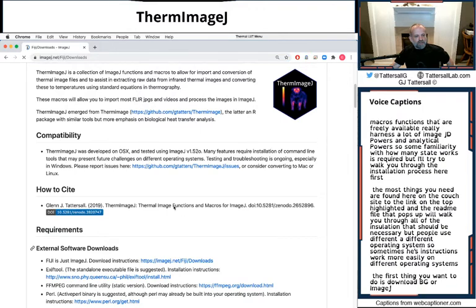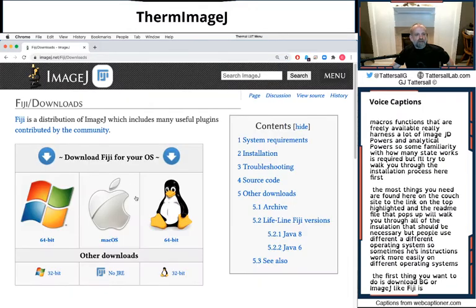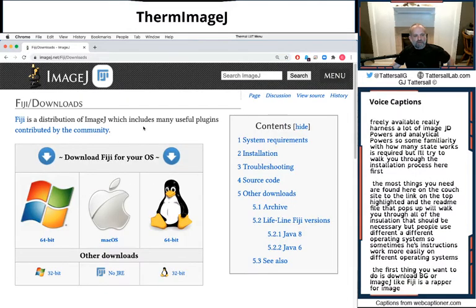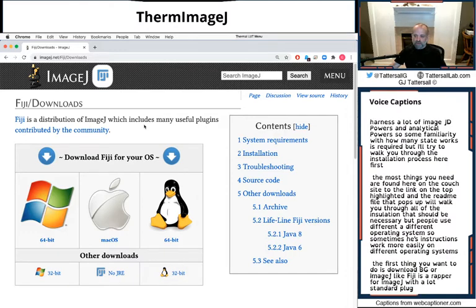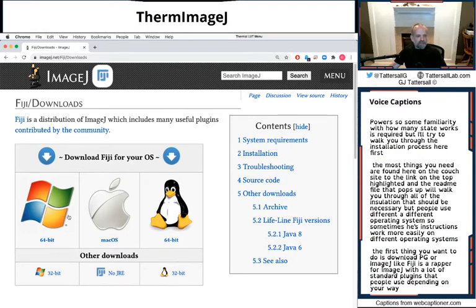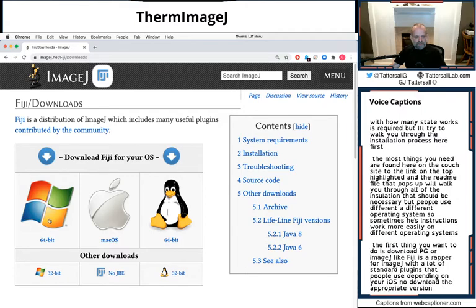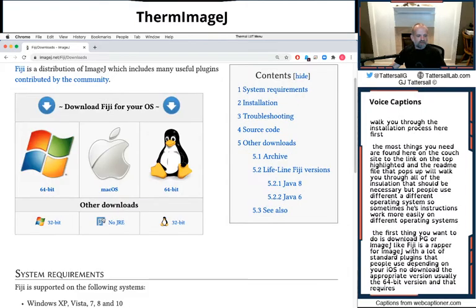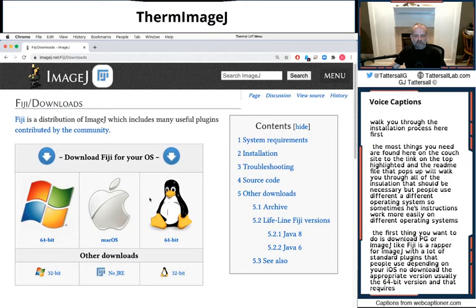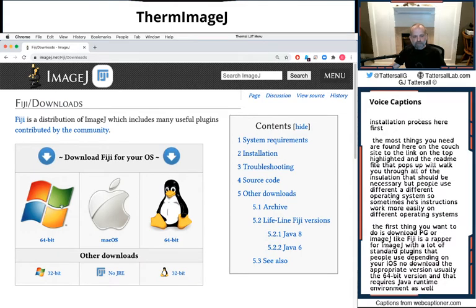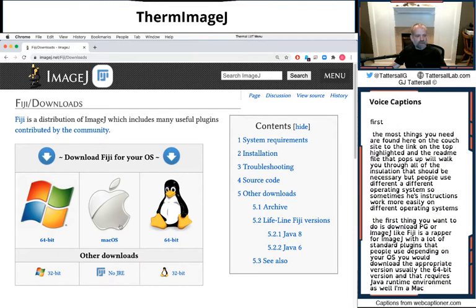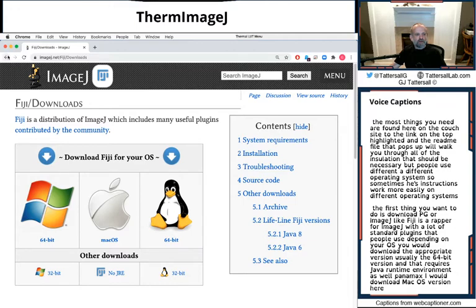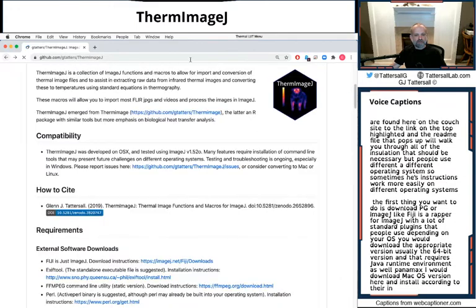Fiji is a wrapper for ImageJ with a lot of the standard plugins that people use. Depending on your OS, you download the appropriate version. Usually the 64-bit version, and it requires Java runtime environment as well. I'm on a Mac, so I would download the Mac OS version here and install according to their default instructions.